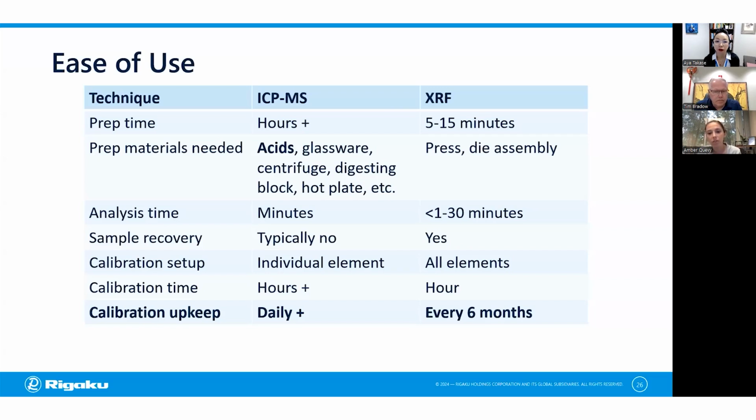In terms of XRF, that's something that is really nice about these instruments because they're self-contained. Everything stays stable. There's not a need to recalibrate often. We recommend recalibration every 6 months. But I'll be honest and say that I probably don't recalibrate my instrument every 6 months. I don't see a lot of drift or a lot of need to.